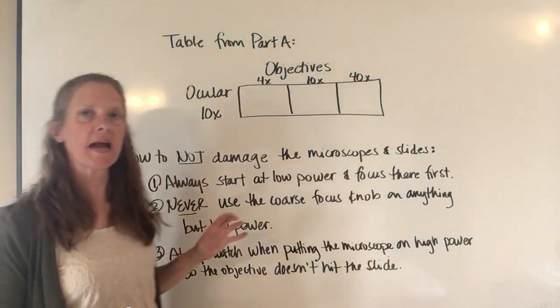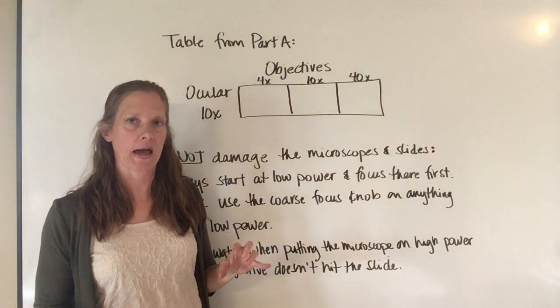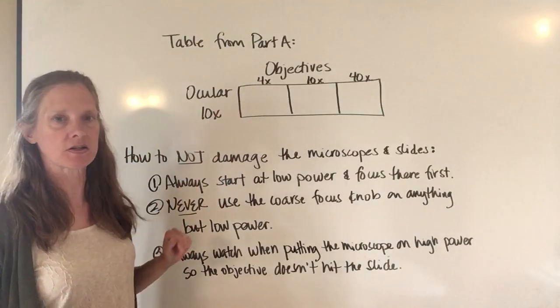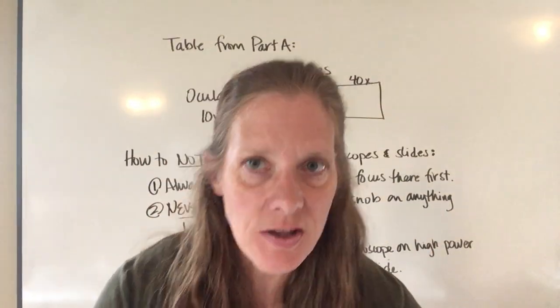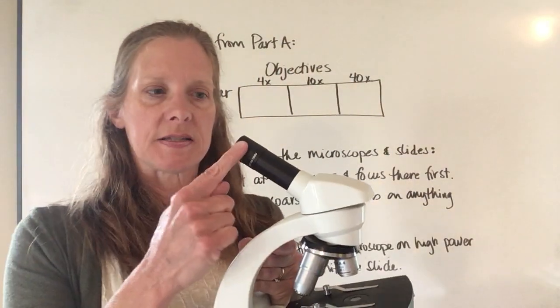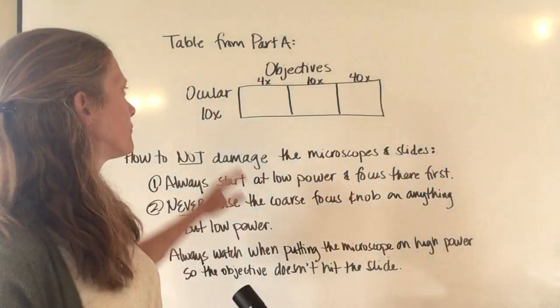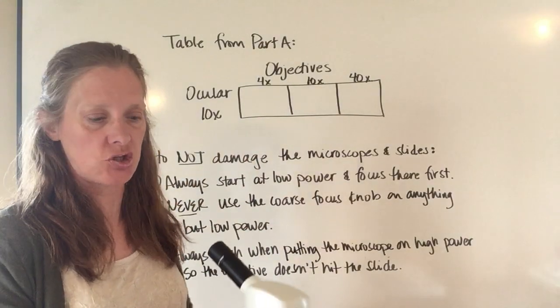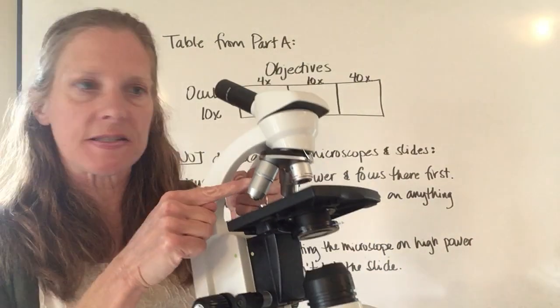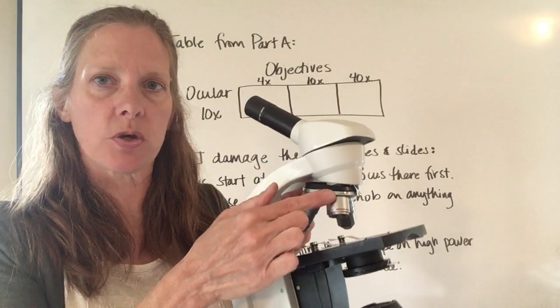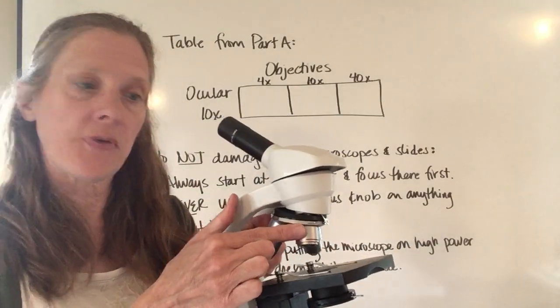It will tell you what magnification you're looking at with each different objective. The ocular of the microscope is this piece right here; by itself it provides 10 times magnification. These pieces down here are called the objectives. The shortest one magnifies 4 times.